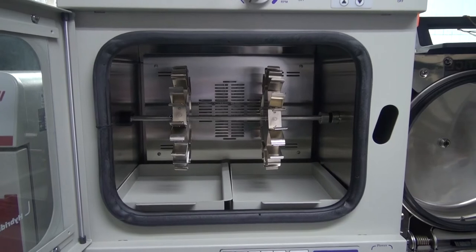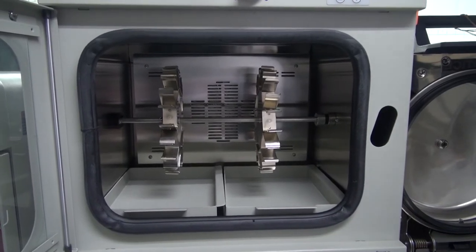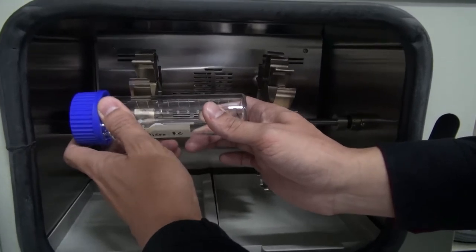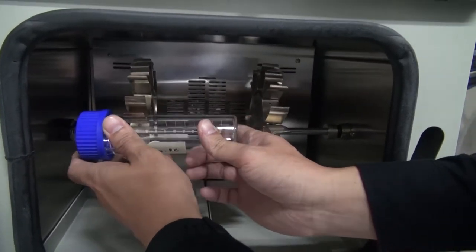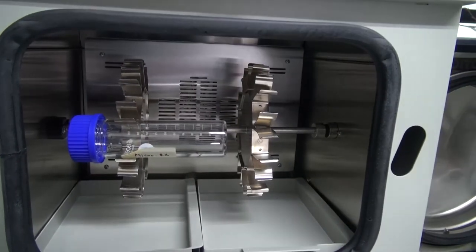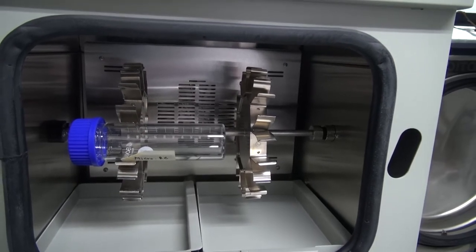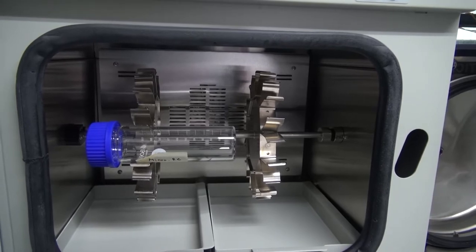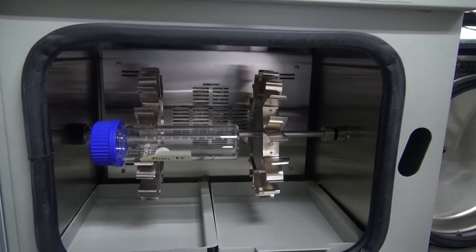To insert the bottle into the bottle clip, gently push the bottle into the clip as shown here. For the long bottle, use two clips. For long bottle, insert one side at a time.